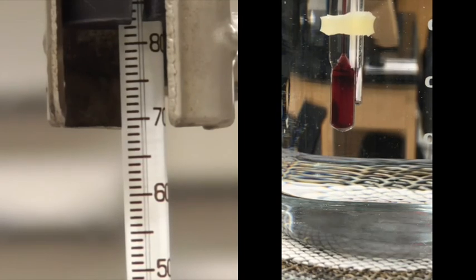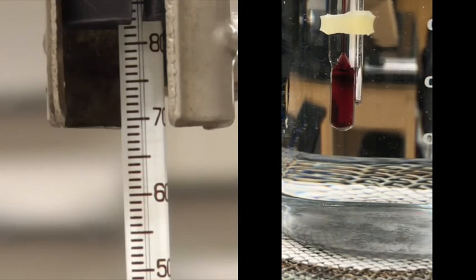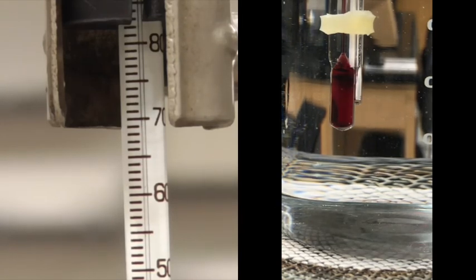Alright, so the thermometer I've just got set about where we need it, so you're probably not going to see the alcohol for a couple minutes here. But you can see in the other camera that we definitely have a solid. So what I did again was I took some of that water out because it was too hot. If we had put our sample in that hot water, it would have just melted. I poured some of it out, not all of it. I added some cold water to cool it down a bit.